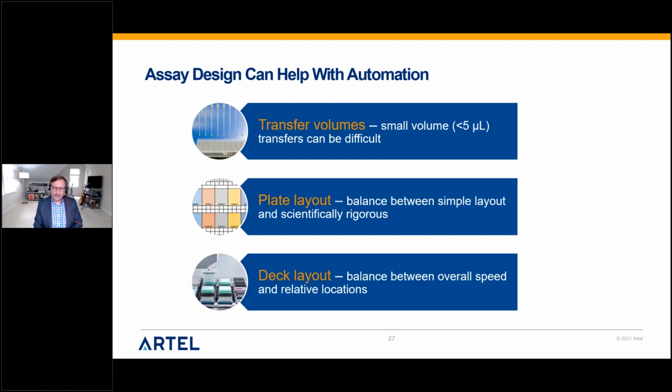And then this isn't really assay design, but it's a deck layout, so it's kind of similar. It would be sort of mimicking how you would set up your bench. So if you have reagents on your bench and you're assembling an assay, it's rare that you would take reagent from over here to my right hand side and then aspirate and then travel over reagents 2 and 3 before you get to your plate, because you can drop in those and you can contaminate. So you have to think about that in your deck layout as well. That's about setting things up appropriately so you're minimizing contamination, and then you can also maximize speed. So again, there's a nice delicate balance.